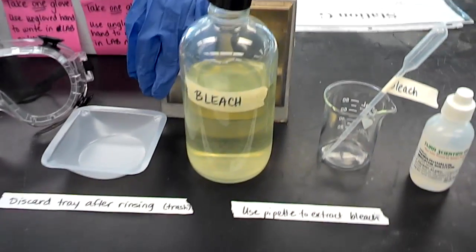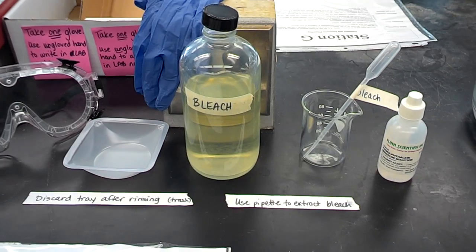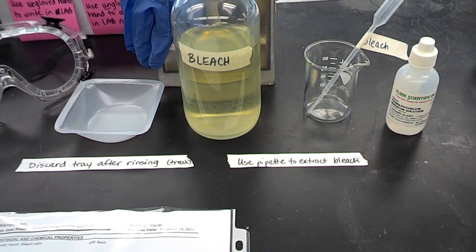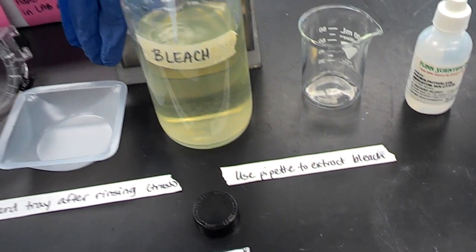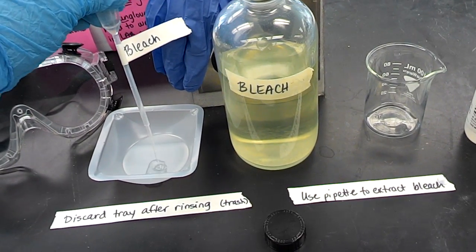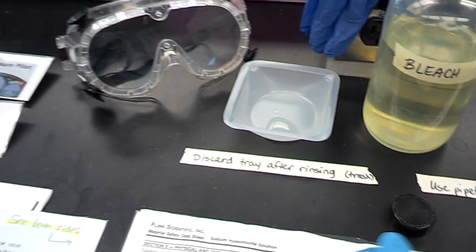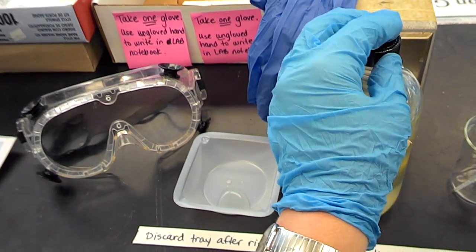Okay, here are the materials for the station. You have bleach and phenolphthalein. So what you're going to do is it tells you in the procedure that you're going to take a whole squirt of bleach. And so you're going to use a pipette and fill it, and you put it in the tray. You can see it's kind of a yellowish solution, but clear, so it's not cloudy. Always put your caps back on your materials when you're not using them.